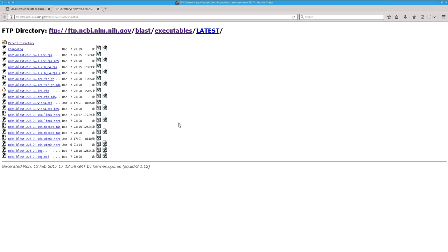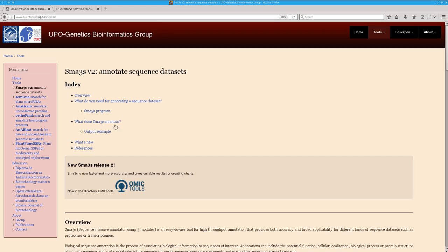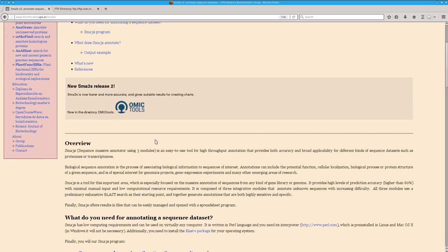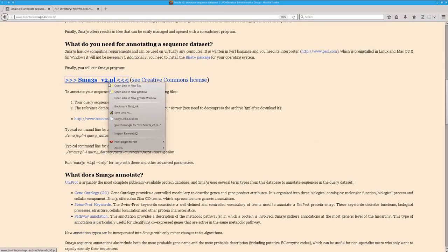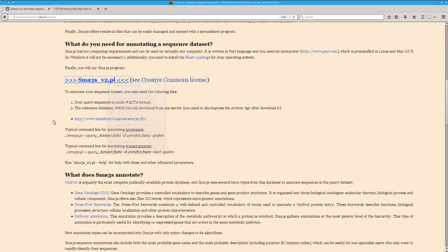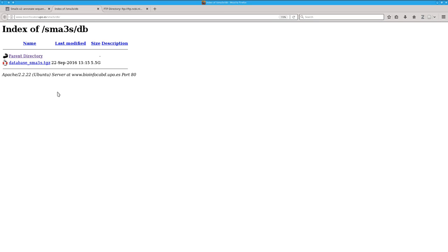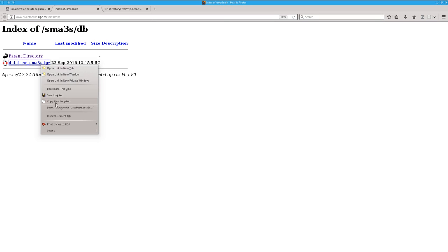In any case, you can download the SMAS3s program now from its website here. Here you have the program and the reference database is here. You also need to download this database.